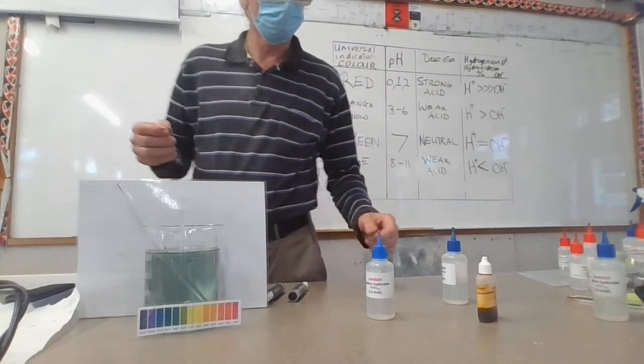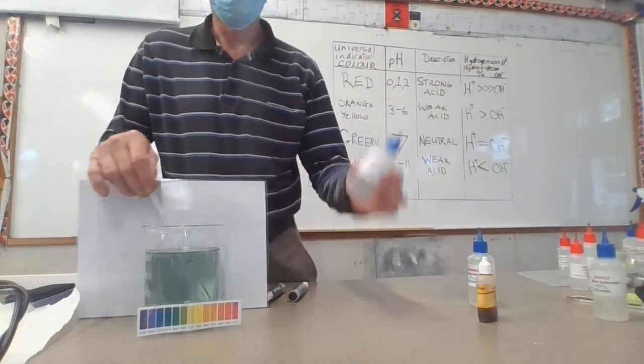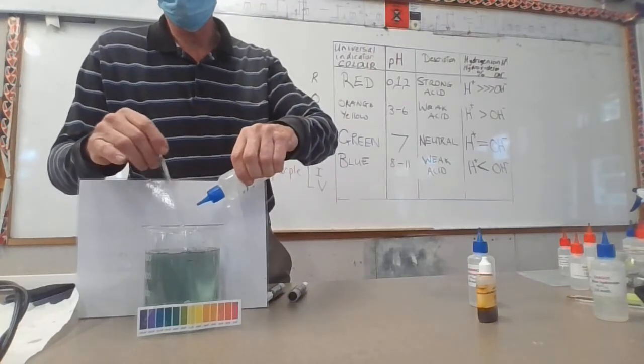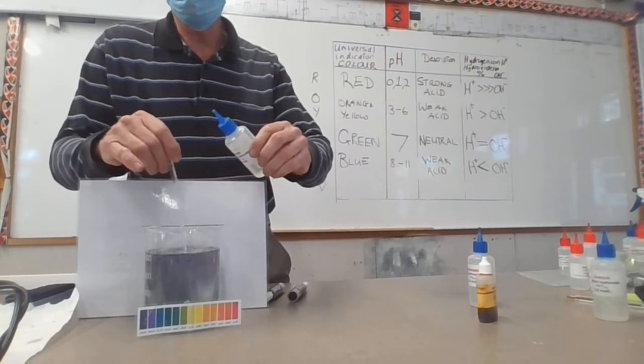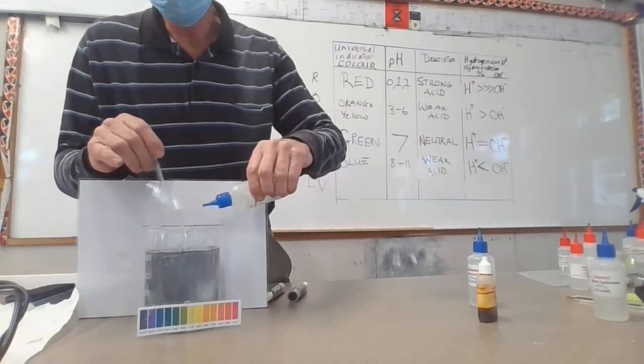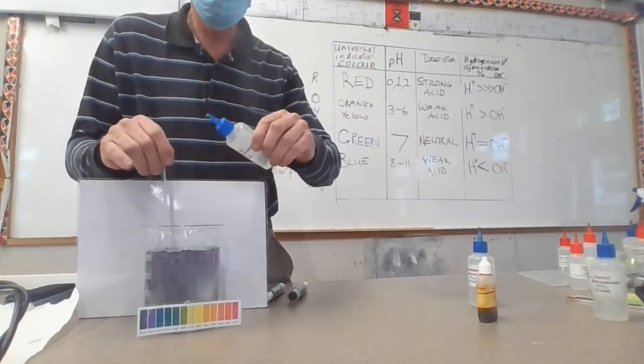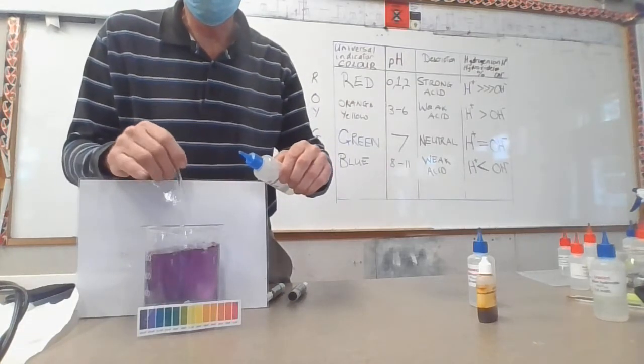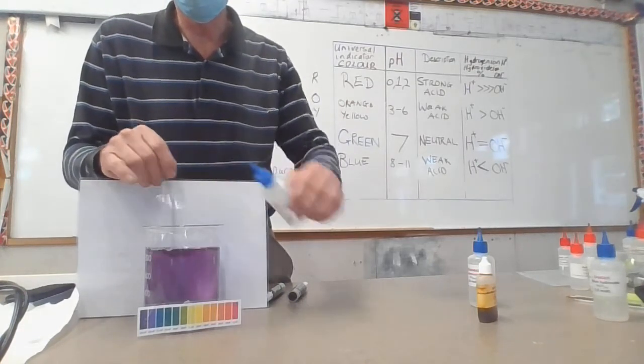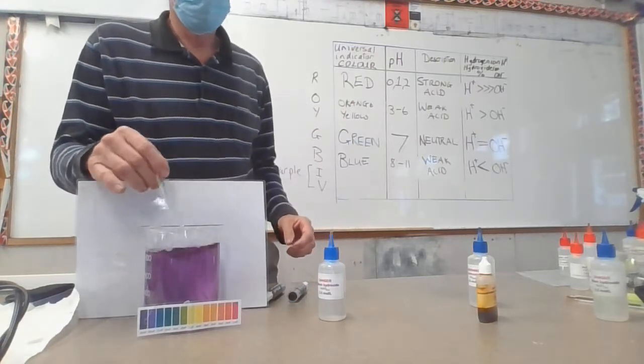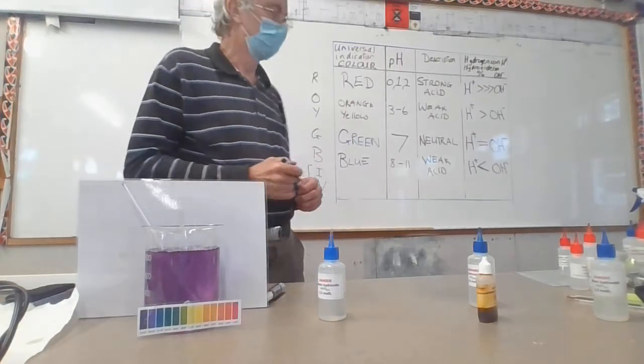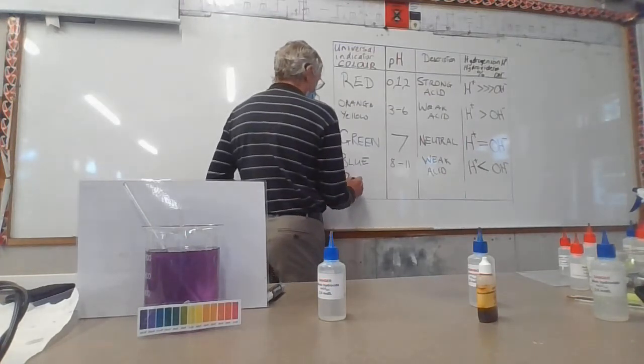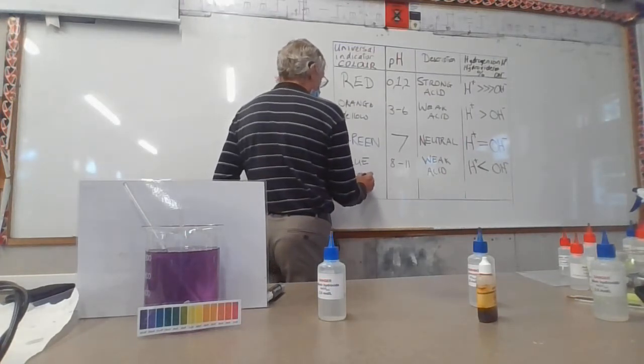I'm going to go back to sodium hydroxide and move into those two purple colors. It'll probably shoot straight through to the violet. There we could get a shade of indigo there, but now we are right through to the red-purple, which is violet. In an exam, those colors are just called purple. Down here, the color will change no more, no matter how much we add.